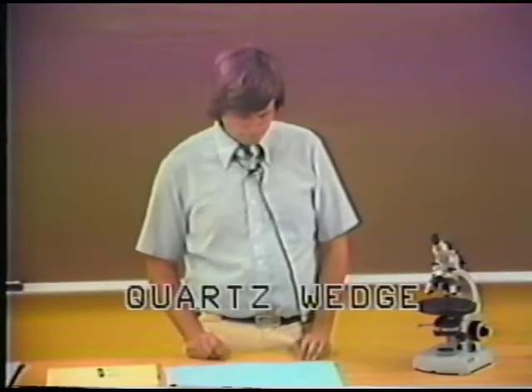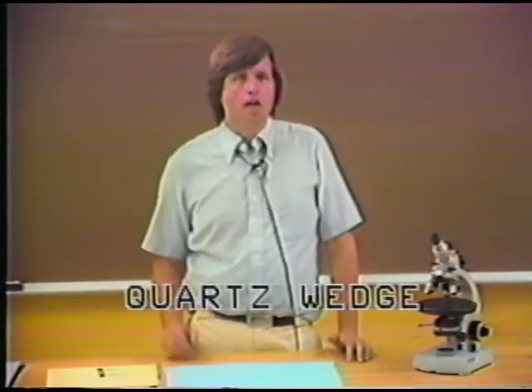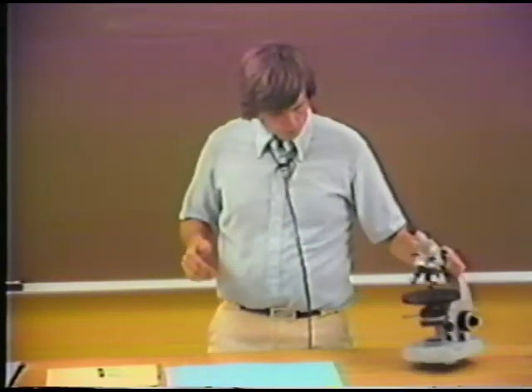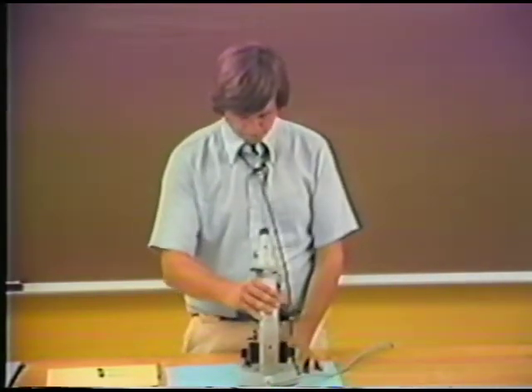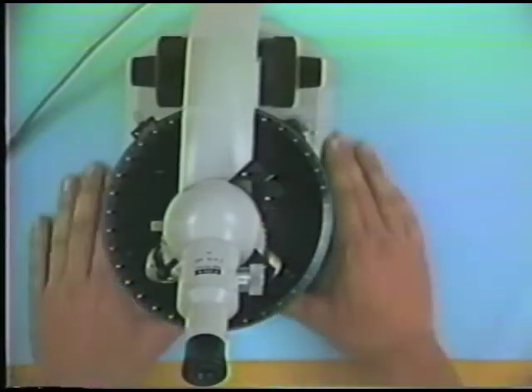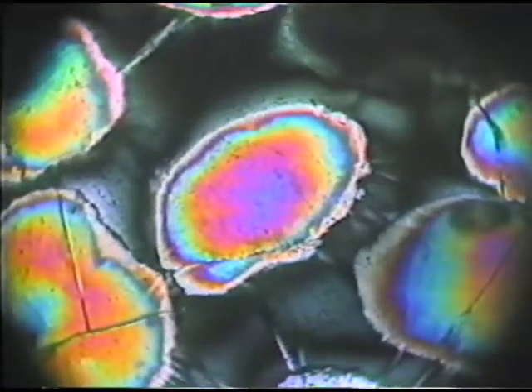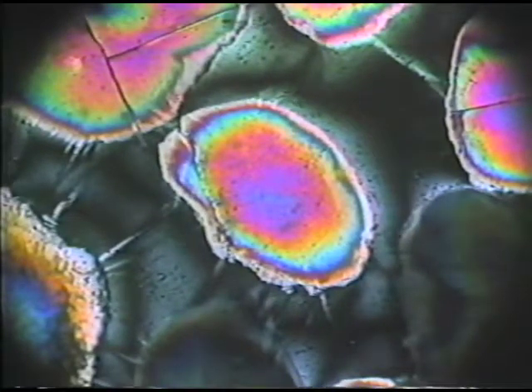Now, I want to demonstrate the use of the quartz wedge, and the kind of material which the quartz wedge is best used on is the mineral mounts which do not have a constant thickness, in which the interference color actually changes throughout the mounts. And so I'm going to show you a mount of some sand grains. The sand grains are mounted on the thin section in such a way that the grains themselves are actually thinner on the edge of the grain than they are in the center of the grain. And I can demonstrate this.